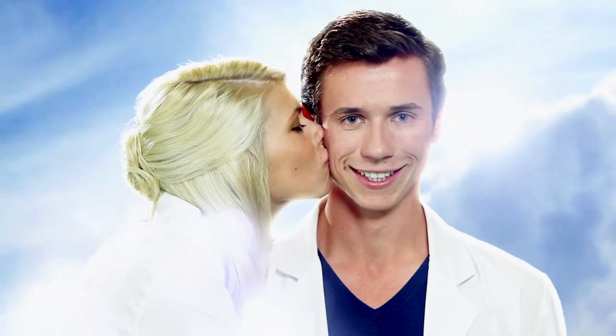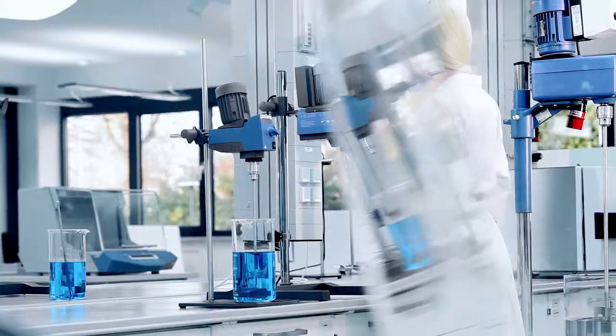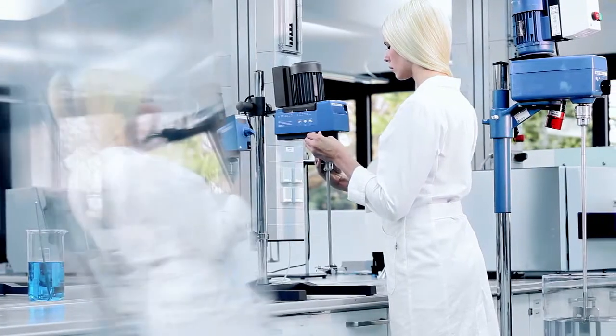It doesn't need to be a dream. Overhead stirrers from IKA. Powerful, reliable and robust.